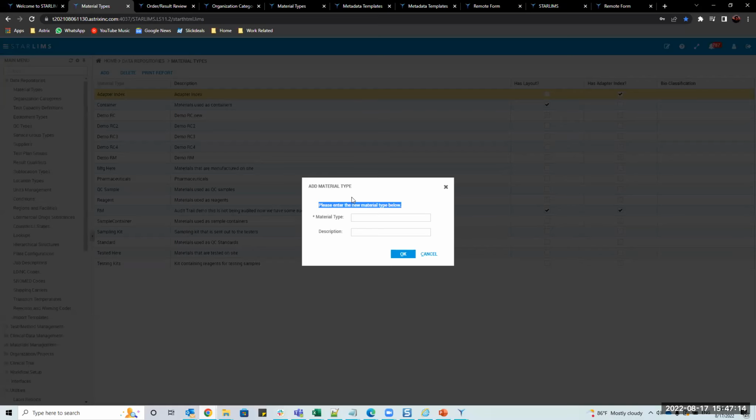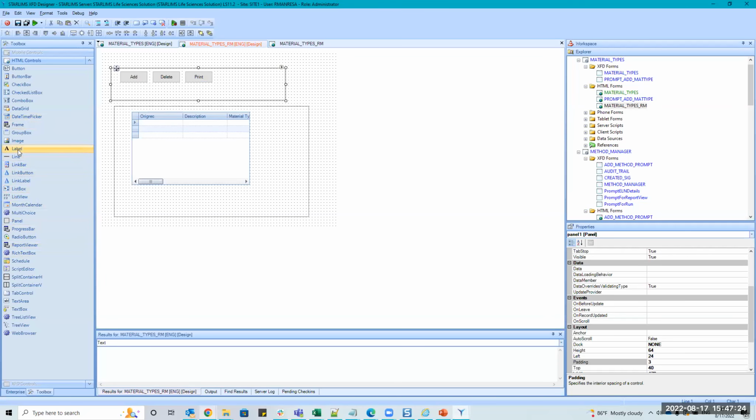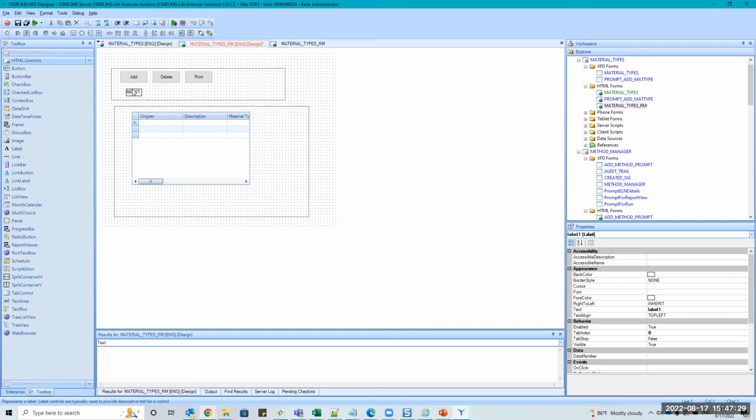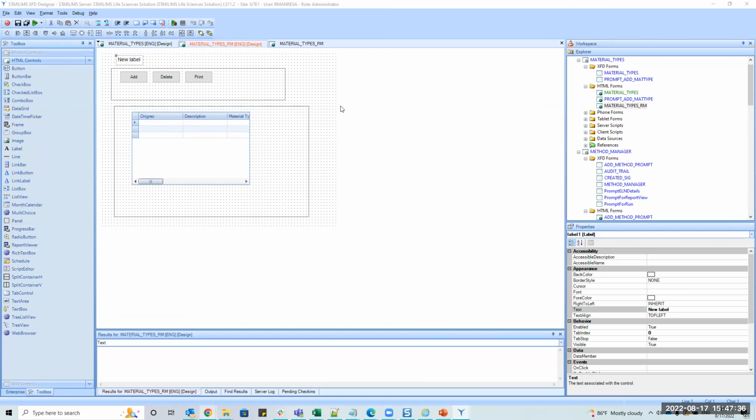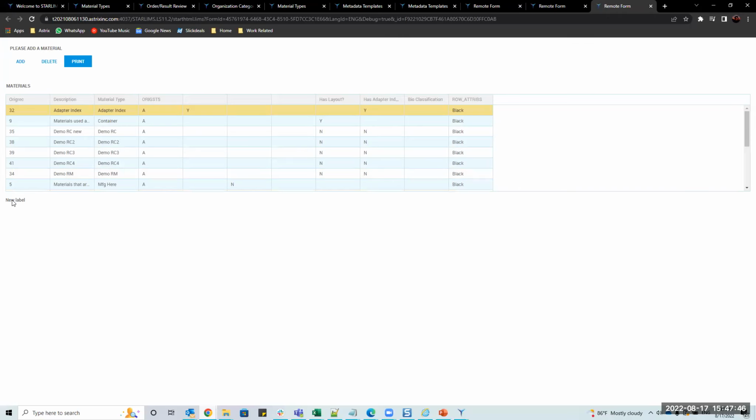Instead of putting it here, I'll put this text in the panel so that it looks a little cleaner, right? So when you don't do it in the properties, this is what I was mentioning, and you just do it as a label. It kind of clashes a little bit in the UI. So let me show you that real quick. It's down here. Yeah, it's not too bad actually.